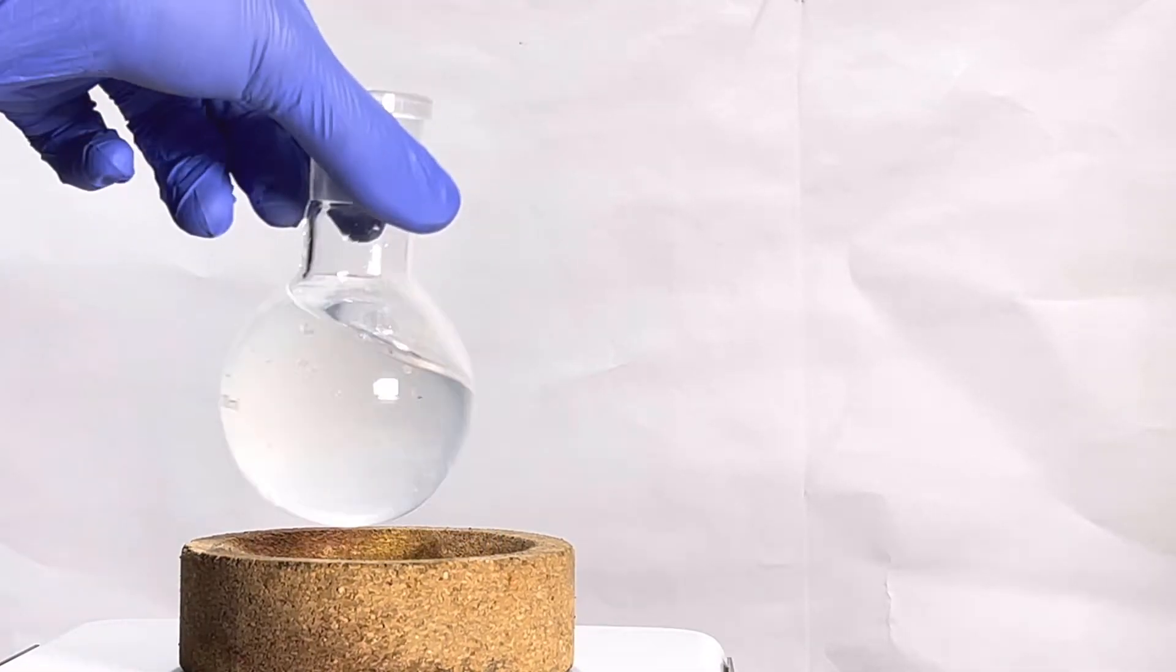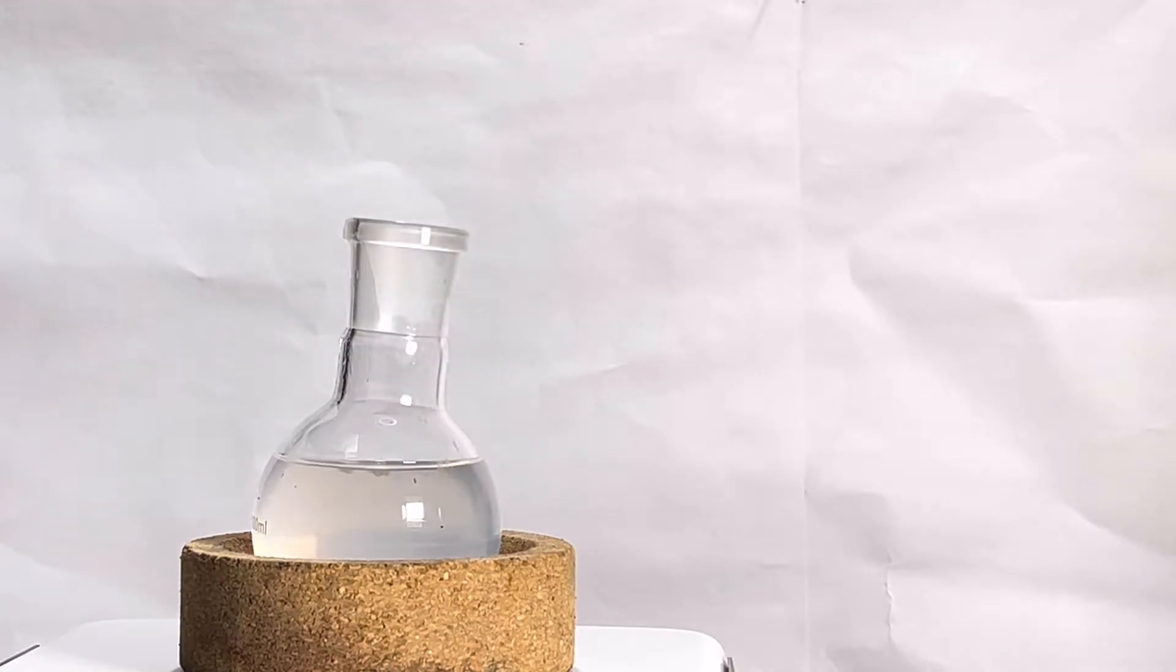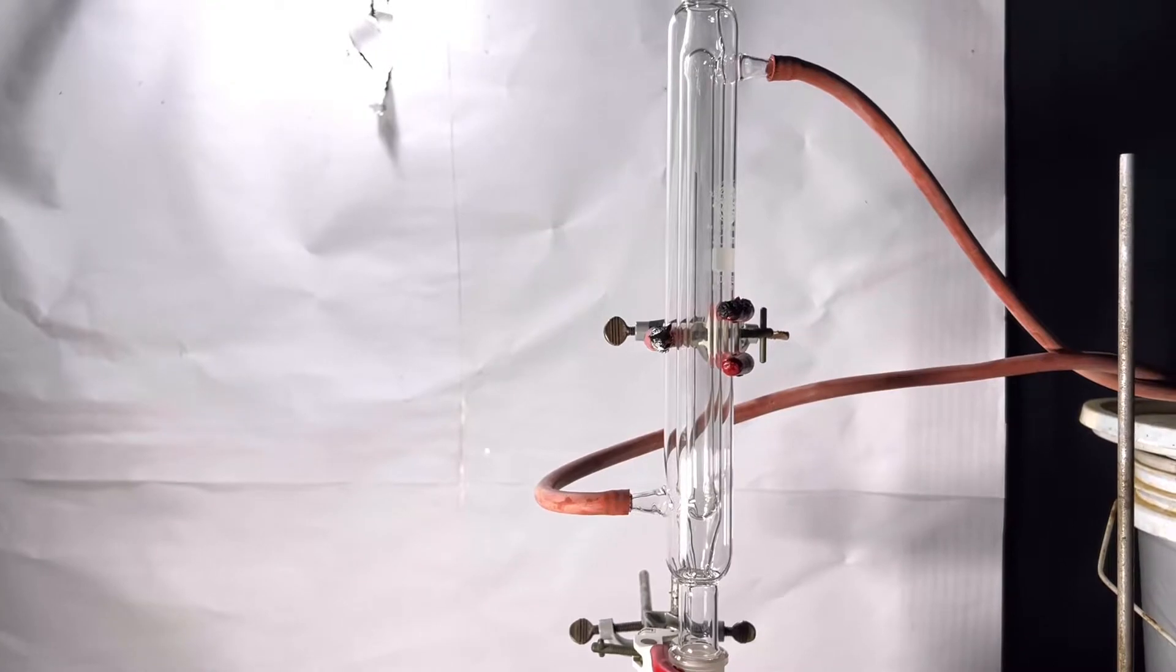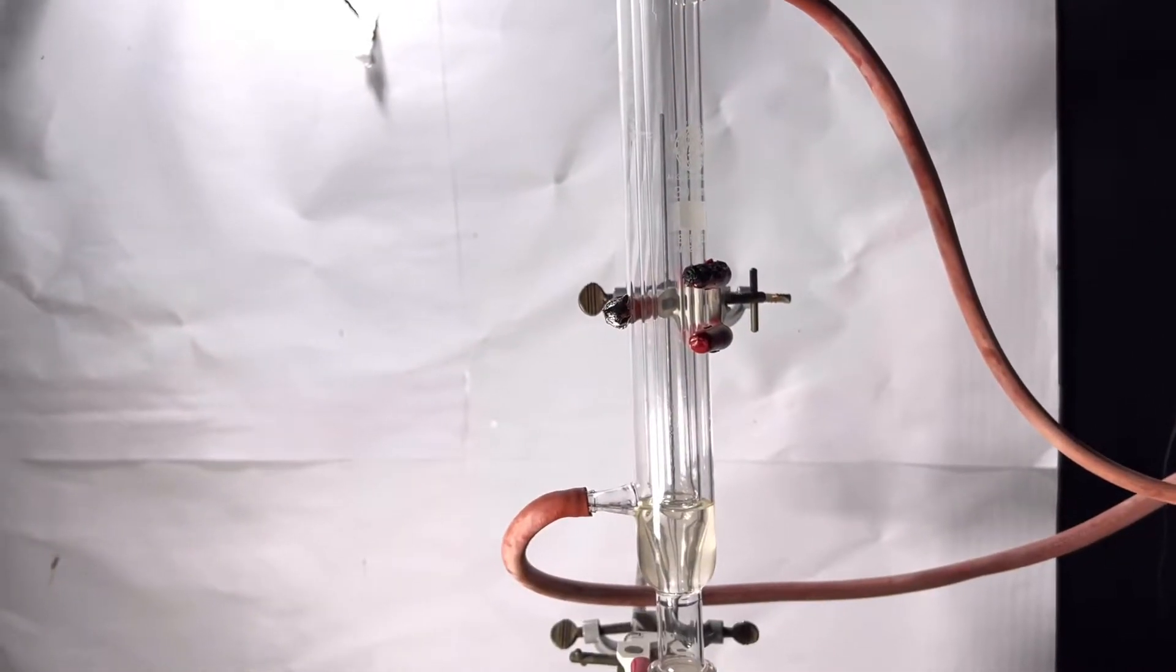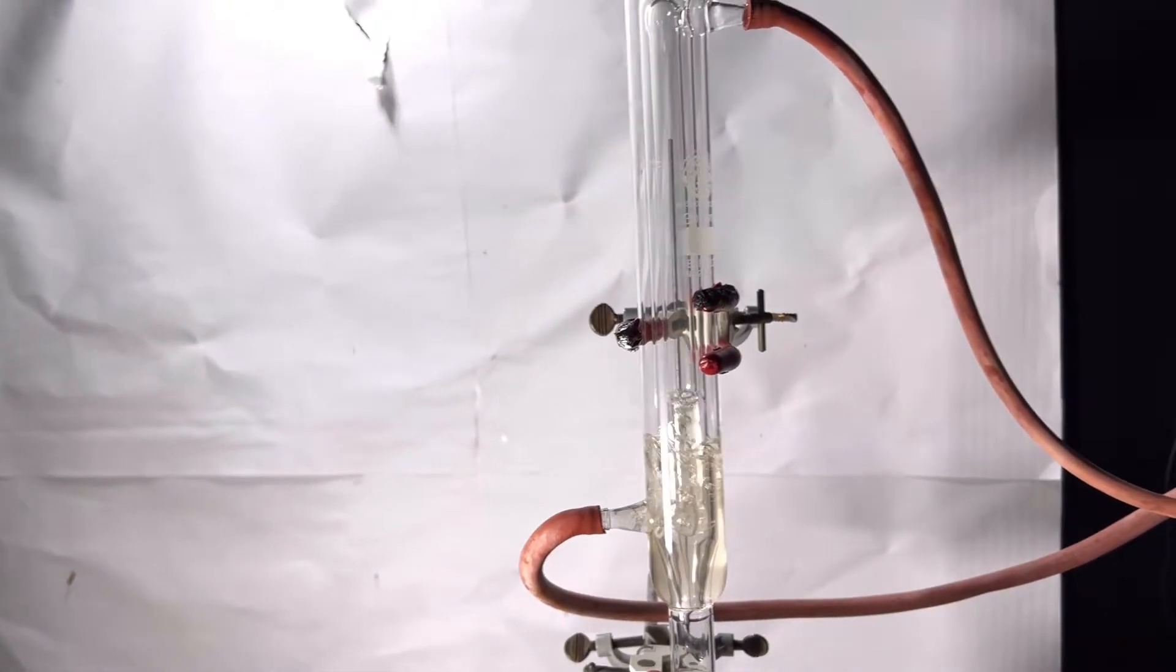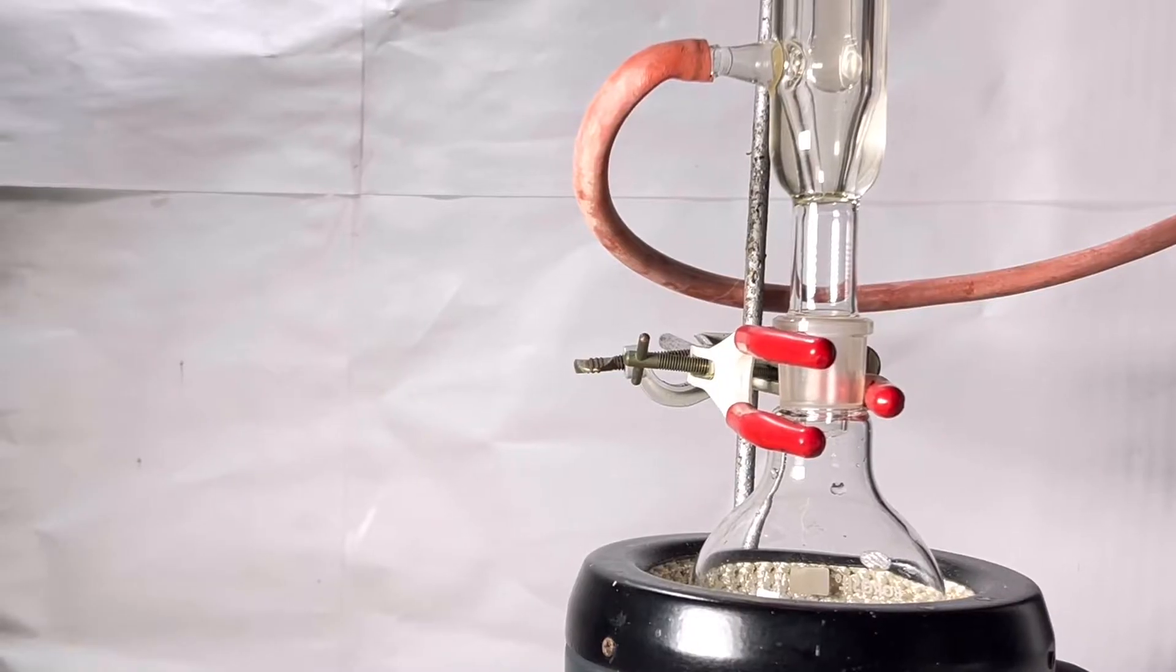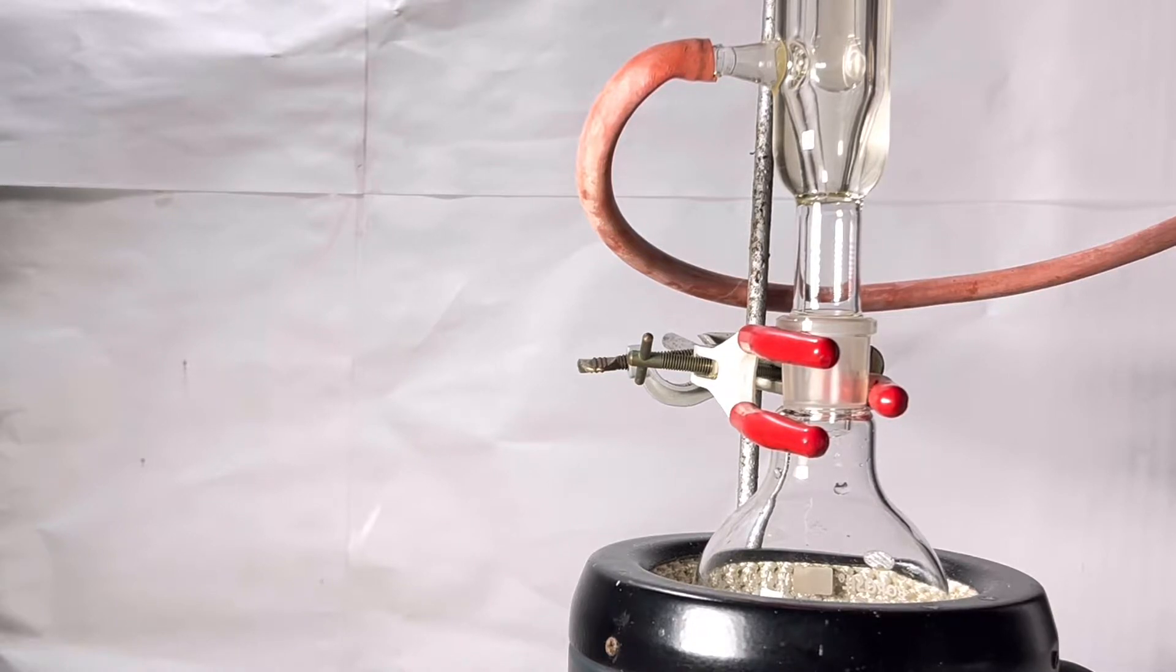Then 60 milliliters of methanol was added to it. Now the previous flask containing sodium cyanide solution is set up for reflux using a double surface condenser. Double surface condenser, as the name suggests, has two columns of water inside providing more surface area for the vapors to condense.